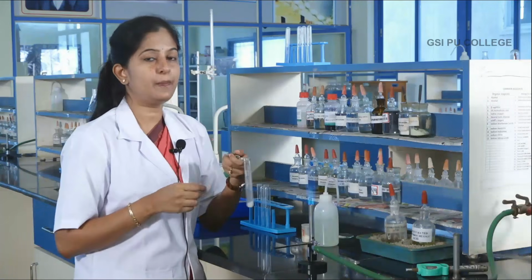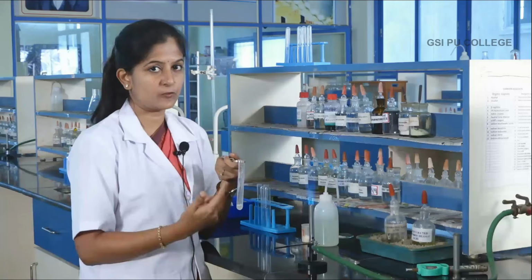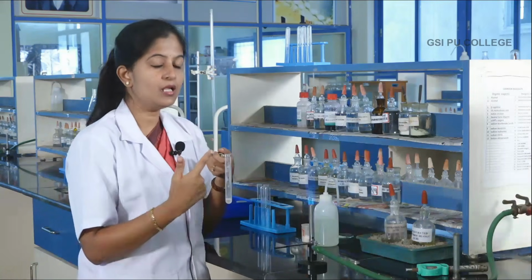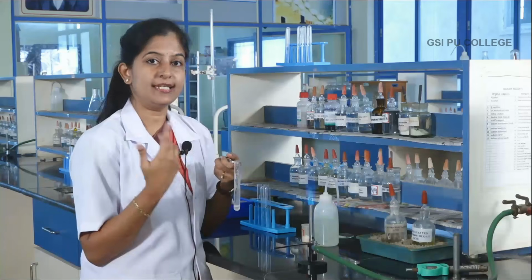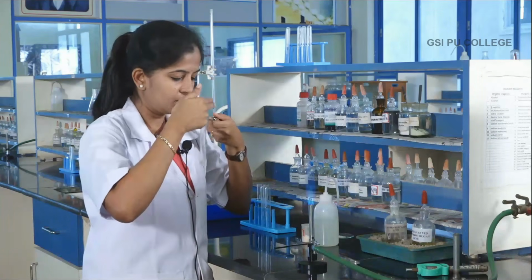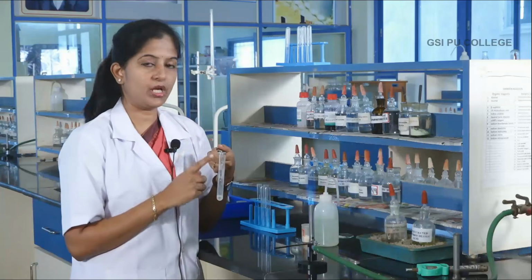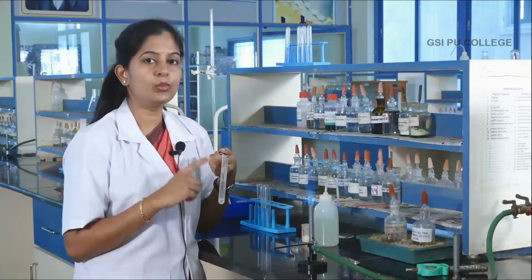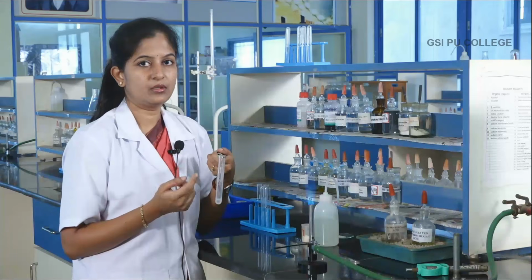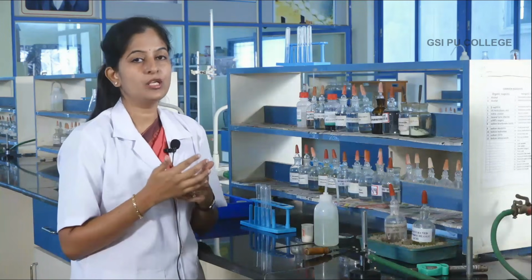Then observe for a pungent smell. If the ammonium radical is present, you will have a pungent smell, otherwise the zero group basic radical, that is ammonium, is absent. So, there is no pungent smell coming out of this test tube, which means that the zero group basic radical ammonium is absent. So, since the zero group basic radical is absent, we have to move on to the first group basic radicals.